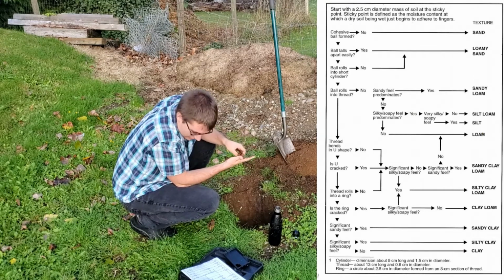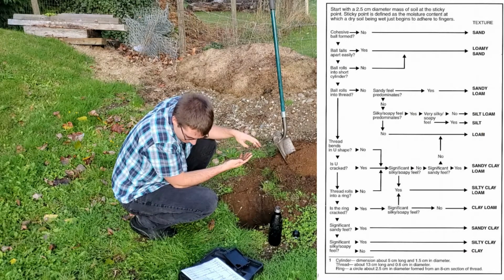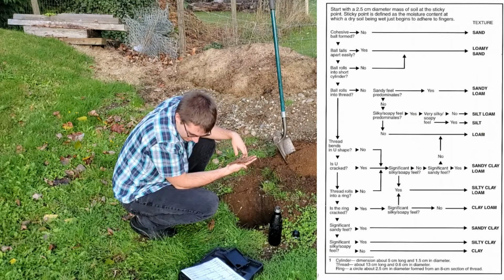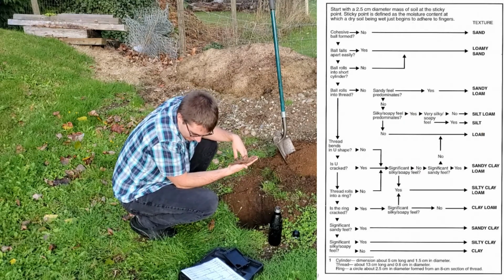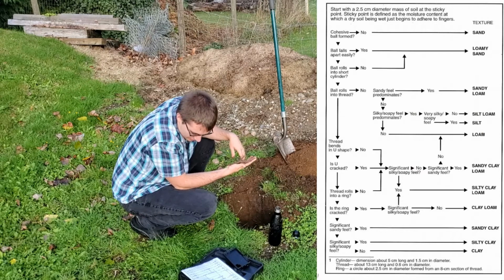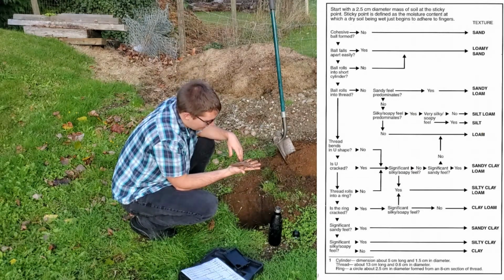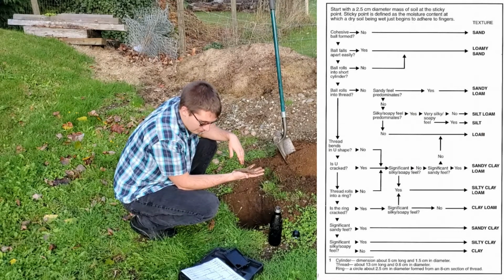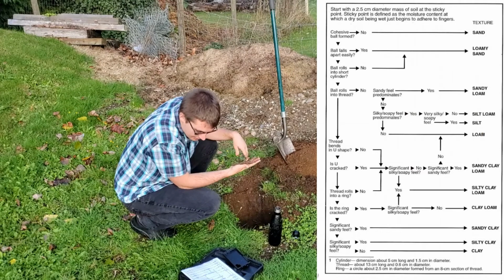No, it does not, actually. At the bottom it says what the cylinder is, which is about 5 centimeters long and 1.5 centimeters in diameter, which this is. And a thread, it says, is 13 centimeters long and 0.6 centimeters in diameter. And this is not going to form a thread. It's falling apart way too easily.